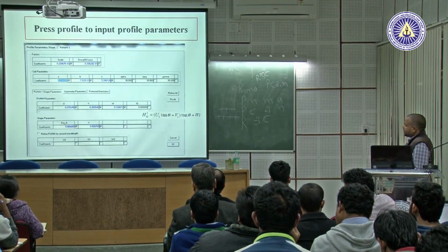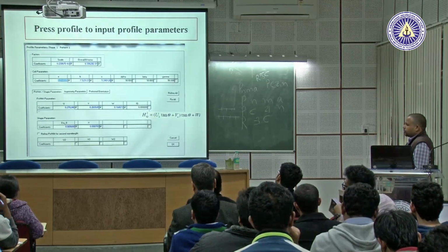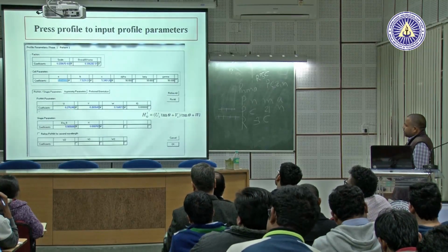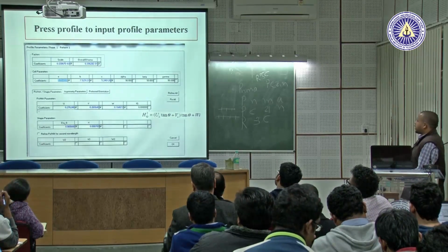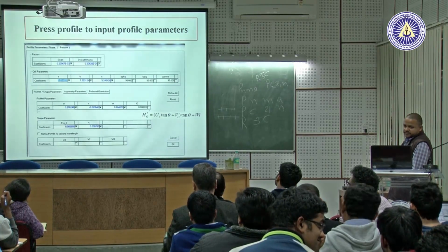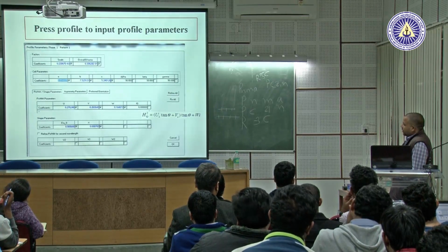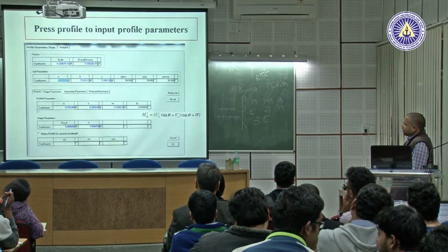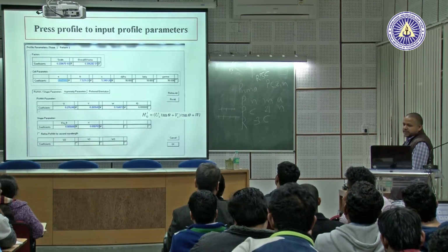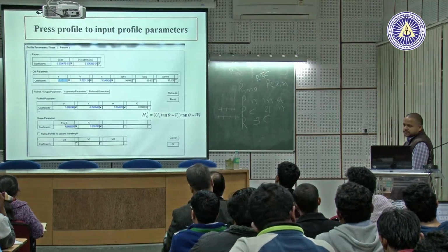The shape parameters eta and x are also related to the pseudo-Voigt function, and all I would like to mention here is that all these parameters should be less than 1. It's a black box. If you refine and it comes out as 2 or 3 or 4, it doesn't mean anything; there are limitations, and it should always be less than 1.